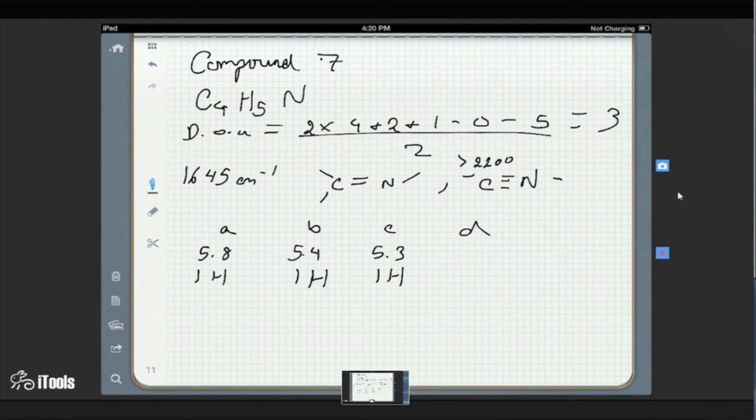So it could be an imine or an alkene. Let's look at the numbers. What did the chart say for an alkene? Just about 1600, and then this is stronger. It's kind of vague. Steve, does your chart say anything a little less vague about the frequency for the imine? My chart has both alkenes and imines around 1660.